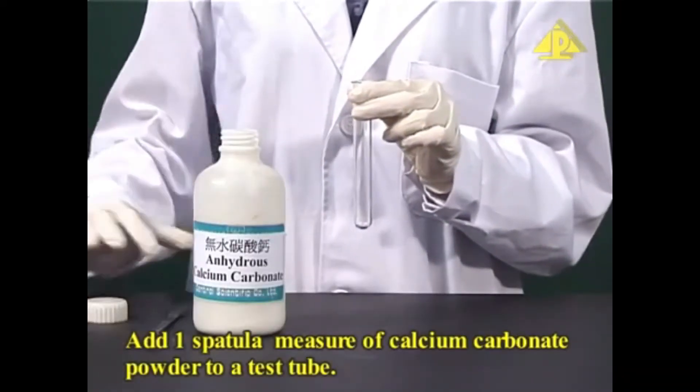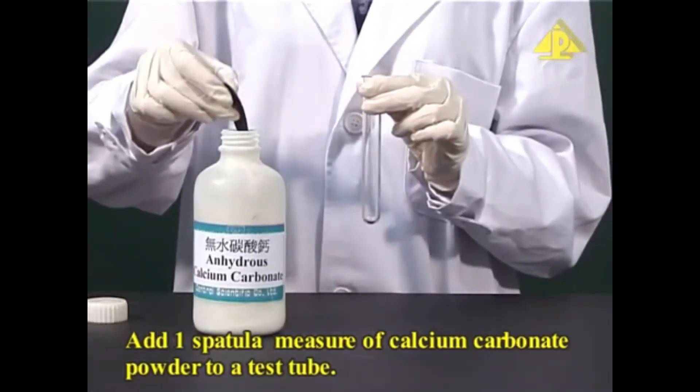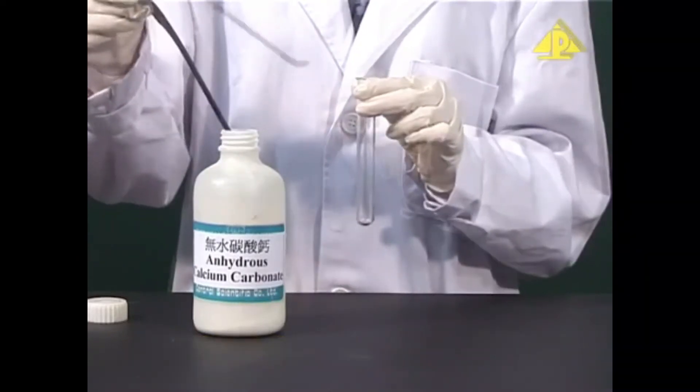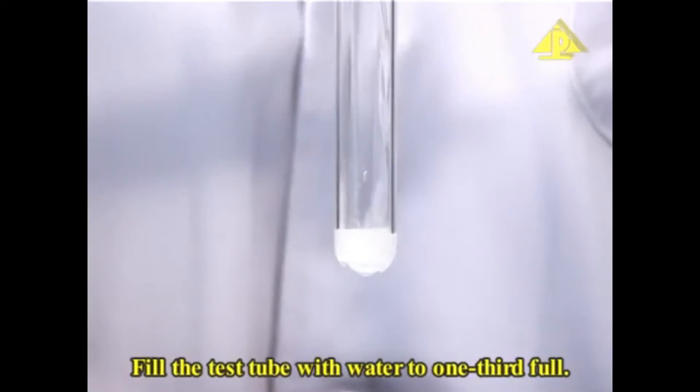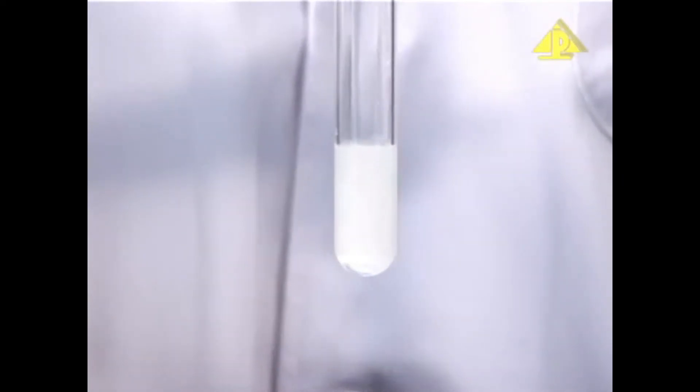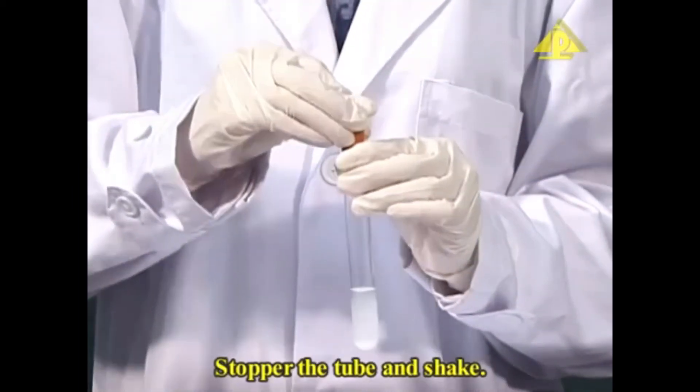Add one spatula measure of calcium carbonate powder to a test tube. Fill the test tube with water to one-third full. Stopper the tube and shake.